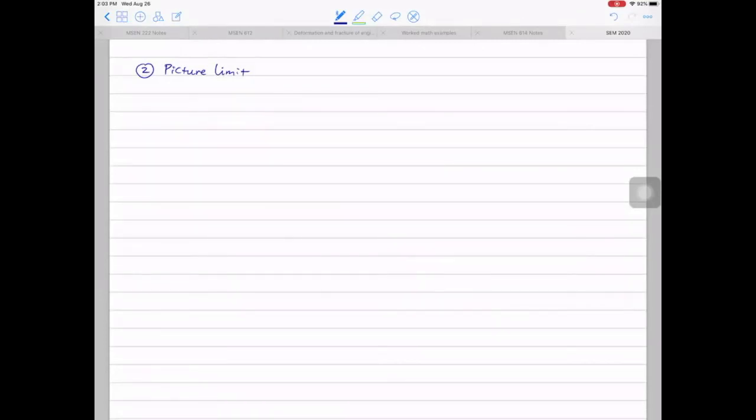If you keep zooming in, then more pixels can participate in representing a feature, and you can see a feature clearer and clearer. So this one is dependent on magnification. Let's call R the resolution of the picture, or R_pict, the resolution of the picture.